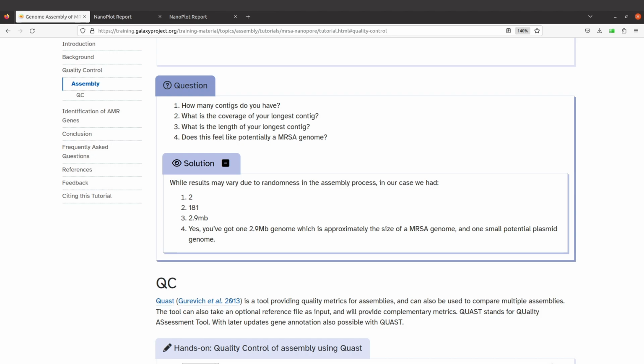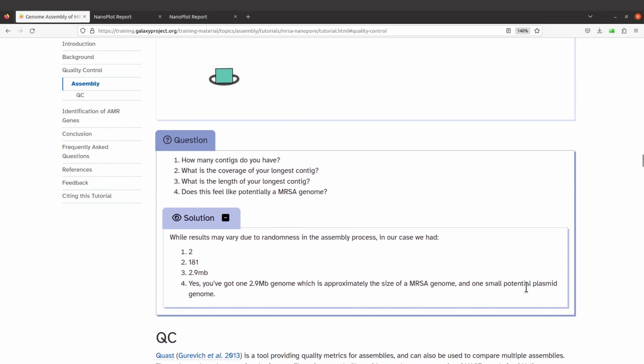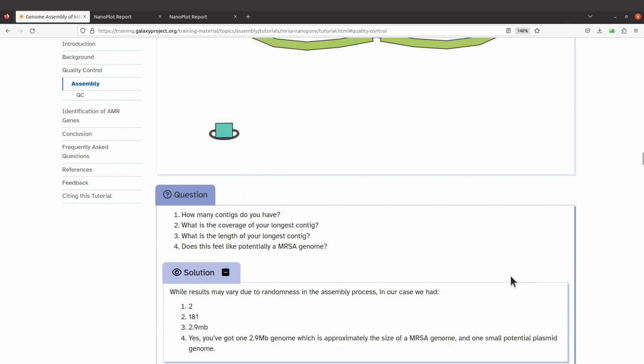So it's important to always do some of these things as you go along, and it also enables you to reproduce the tutorial, or let me say the work. Doing these things helps you to get a workflow or a pipeline that can be reproduced, because at the end of the day, if you have your results and they're not reproducible, then it becomes a challenge. So it's always important to do these things, and it also gives you the confidence.